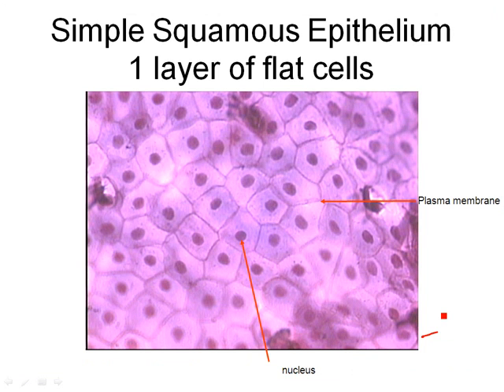All right, so hopefully you've watched all the videos on what epithelial tissue is, what a connective tissue is, a muscle tissue, and a nervous tissue. And this is going to show you, again, what it looks like under the microscope. If you think back to epithelial tissue, what do epithelial tissues do? They basically line organs, inside your cheek. That's epithelial tissue. And when you talk about epithelial tissue, you look at the shape of the cell, and you look at how many of them there are, how many layers there are. Do you remember that from your video? Karen Richardson did that video.